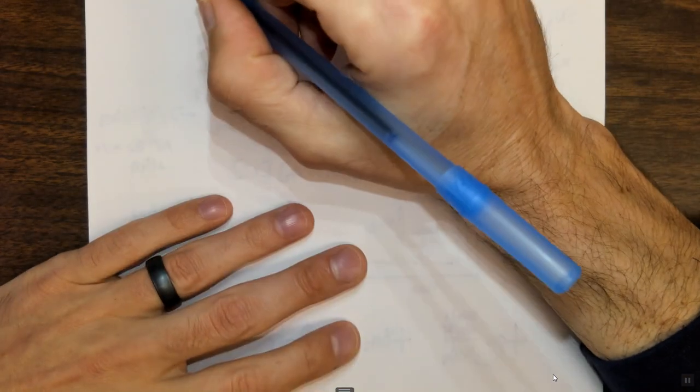So the first thing to notice is that separation schemes start at the end of a reaction. So when the reaction's over, the separation scheme begins. I always give the example of aspirin. Aspirin is made with salicylic acid and acetic anhydride in the presence of sulfuric acid. Nobody wants sulfuric acid in their aspirin. You probably don't want salicylic acid or acetic anhydride either, but you definitely don't want sulfuric acid. So we have to separate the aspirin from the stuff required to make the aspirin. It's just something chemists do, and in this course, something you do.